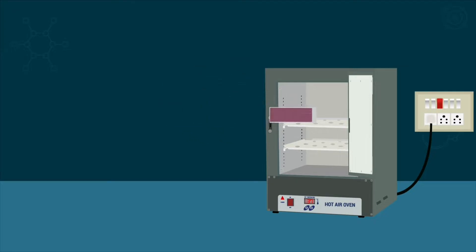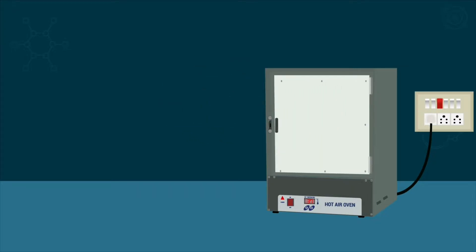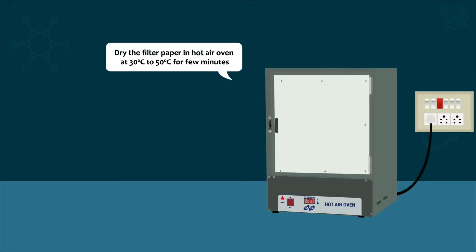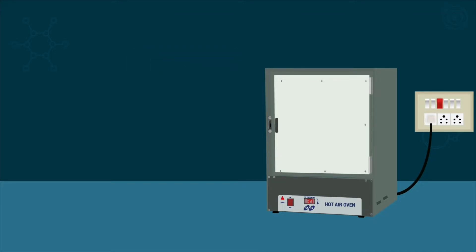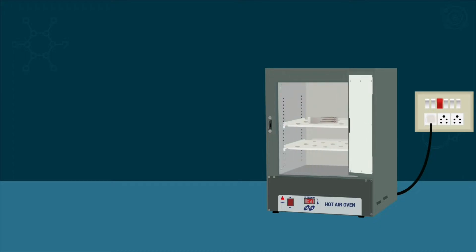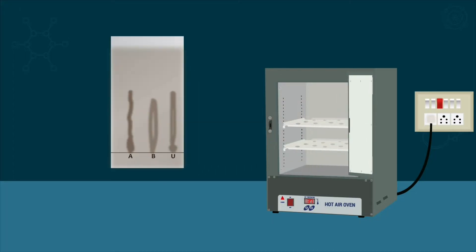Place it in the oven at 30 to 50 degrees centigrade for a few minutes. After drying it, you can take it out.